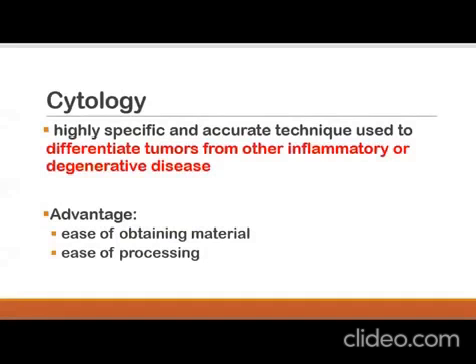So, in cytology po kasi, we are dealing here with highly specific and accurate techniques for us to differentiate tumors na related lang po sa inflammation or tumors related lang po sa degenerative diseases o di kaya tumors na malignant. Okay, so usually yung mga techniques under cytology na dyan nagfo-focus to differentiate tumors that could be inflammatory, that could be caused by degenerative diseases, or it could be from malignancy.